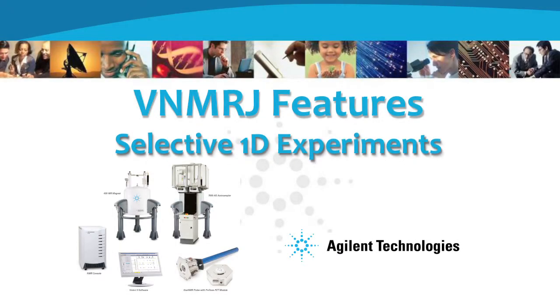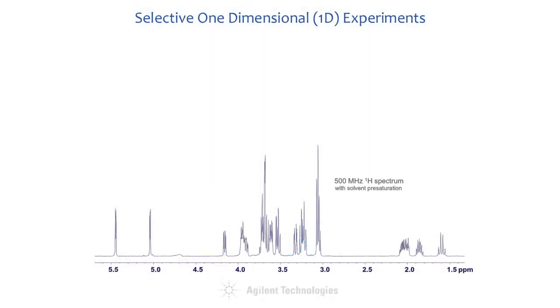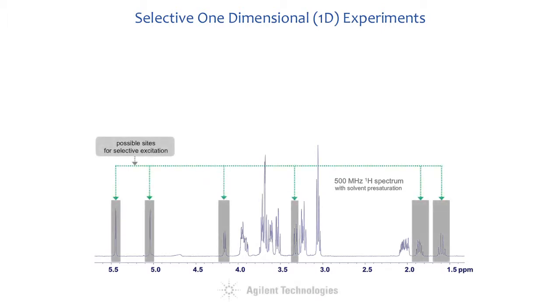When the requested structural information is associated with one or just a few isolated multiplets in the proton spectrum, then selective 1D experiments are often the natural choice of the NMR spectroscopist. They are significantly faster to acquire and, unlike their two-dimensional equivalents, the obtainable fine structure is never compromised by limited digital resolution. The position and the optimum bandwidth of the selected pulses, however, need to be individually matched for each target signal in the proton spectrum of every sample.